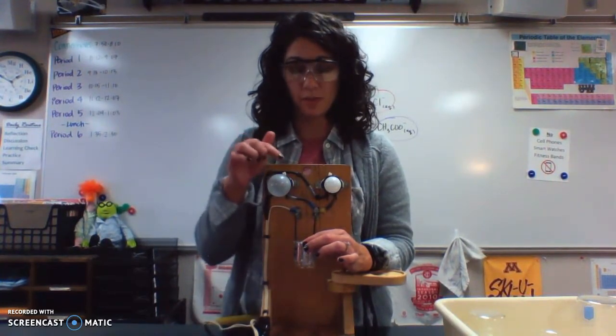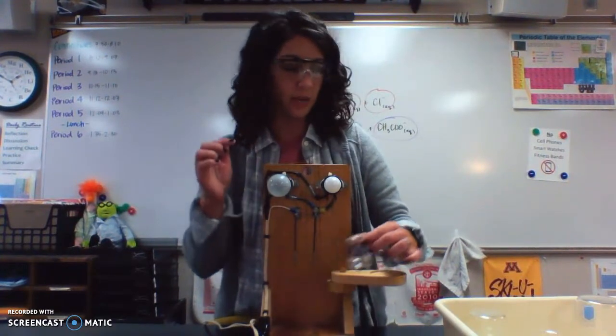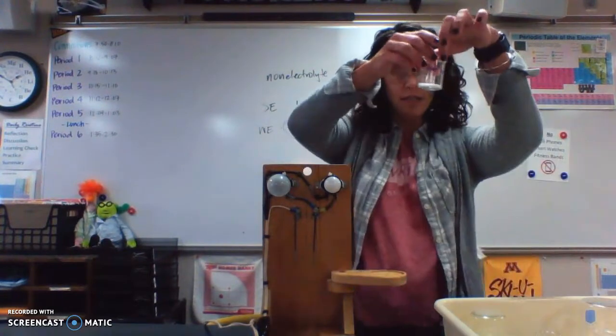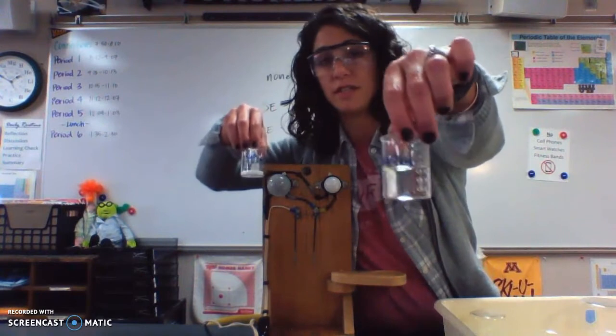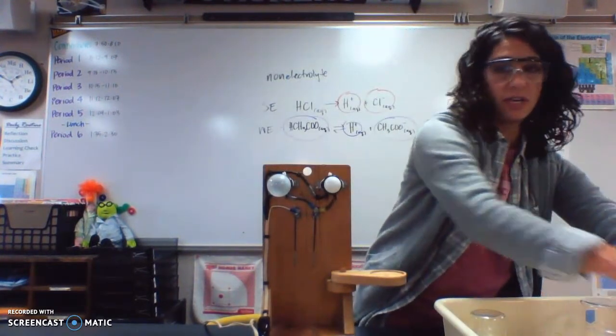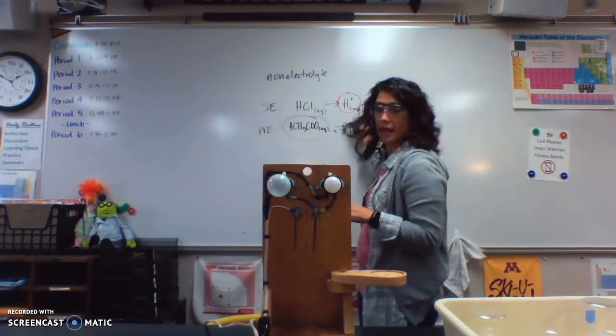So think about why this one's a non-electrolyte. Just because it's a liquid doesn't mean it will dissociate. It's just like the table salt, solid ions versus the salt solution. It needs water to dissociate. So if I had a liquid here, an L here, this would not happen.